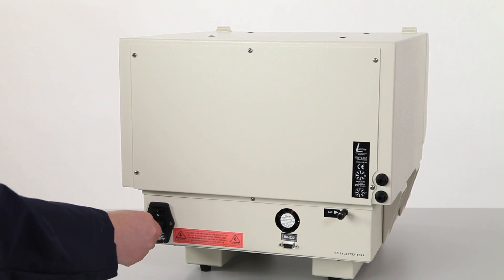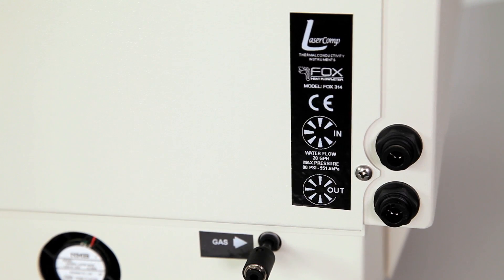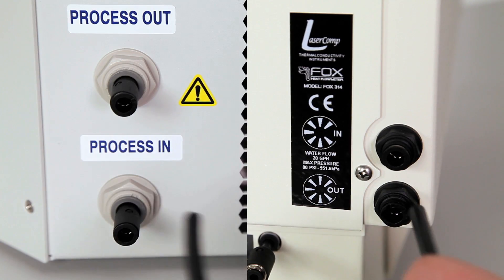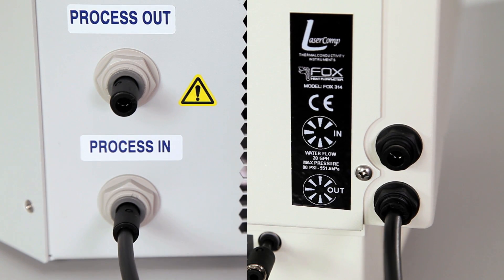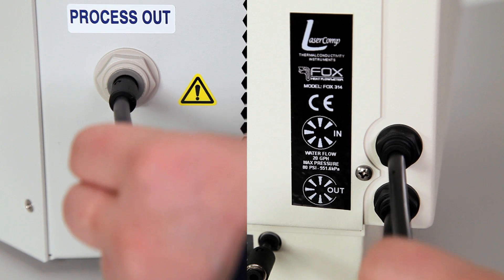Start with the power cable. We can now connect the chiller using the quarter inch water hose. Connect the inlet of the instrument to the outlet of the chiller, and the outlet of the instrument to the inlet of the chiller.